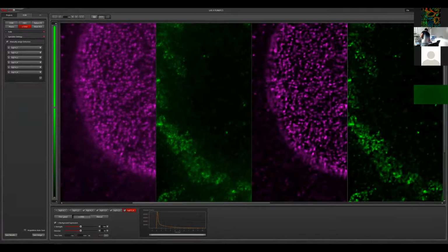Thanks, Mariano. There was one more question from Yanin, which I already tried to answer in the chat window. The question was, what is the Z resolution, which I did not mention. It depends, of course, on what kind of fluorophore and sample you're using, but let's say in an optimal case, the Z resolution will be better than 100 nanometers for Tau-STED.